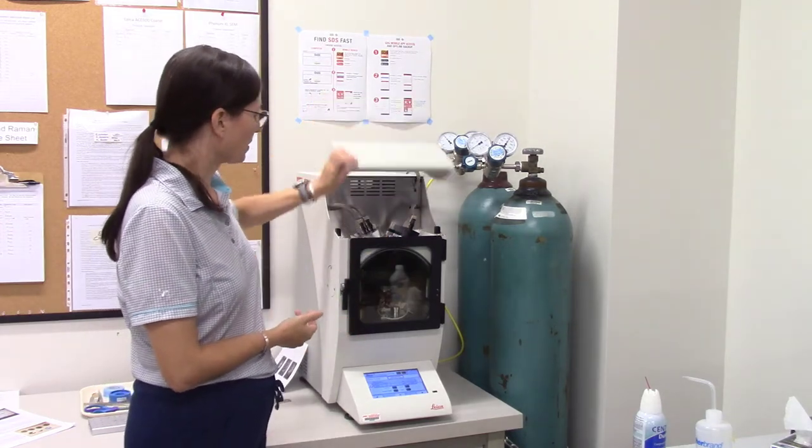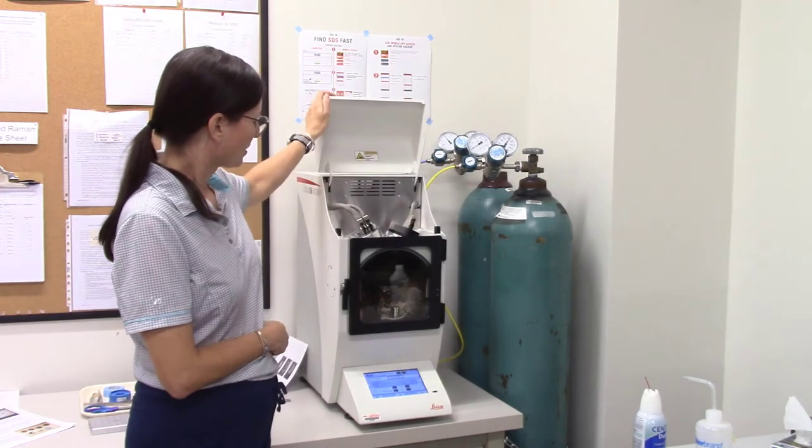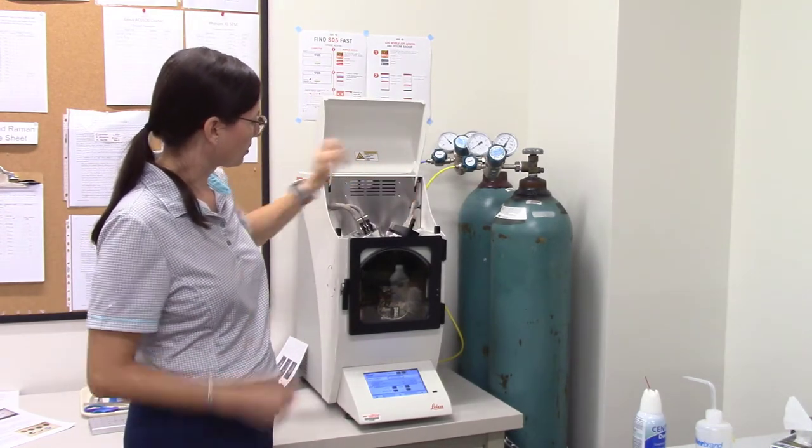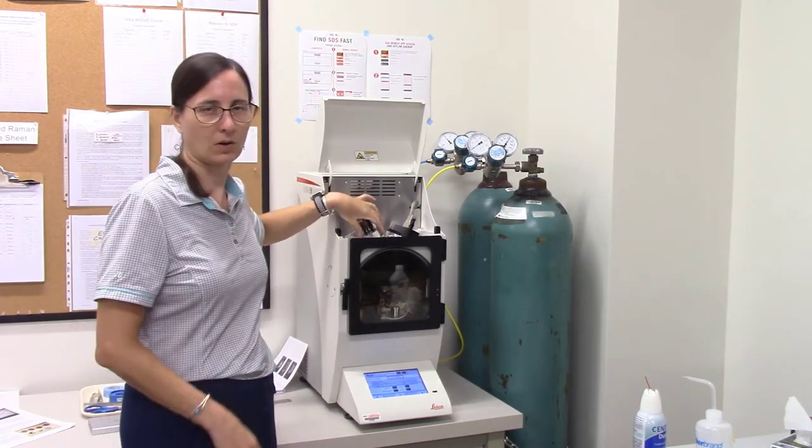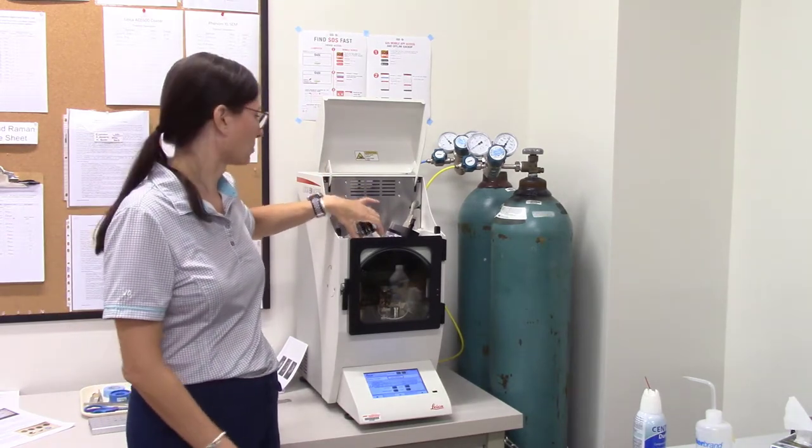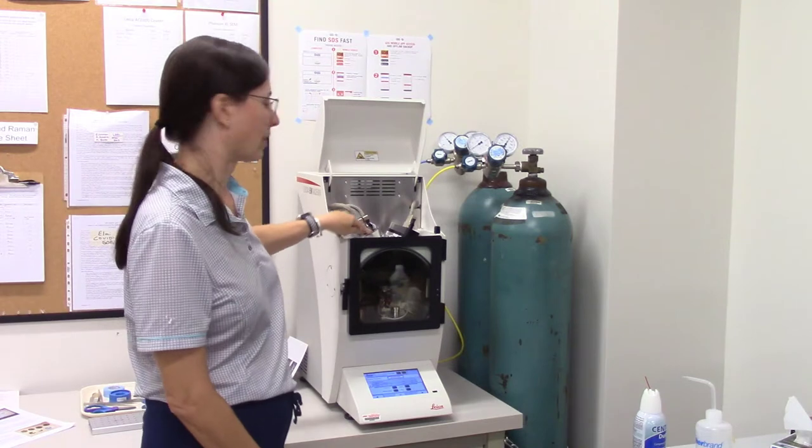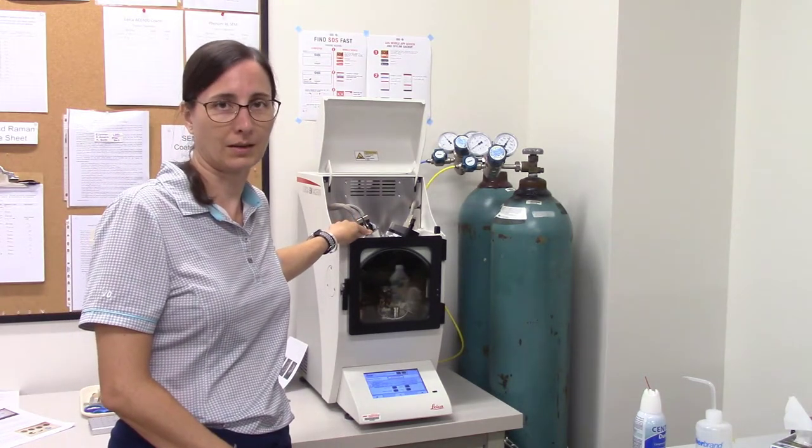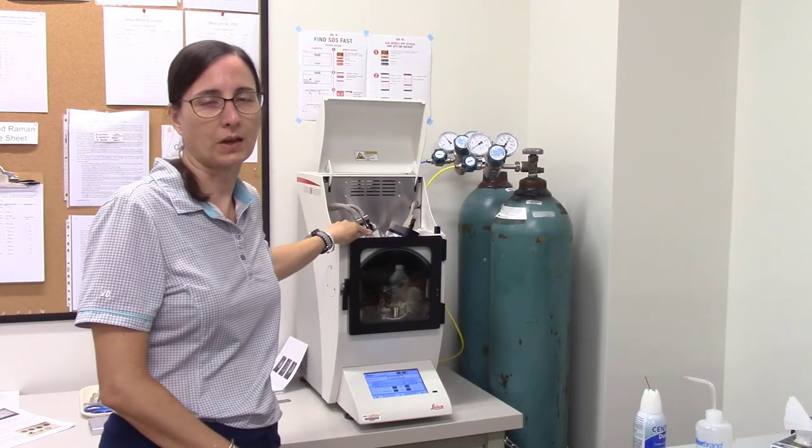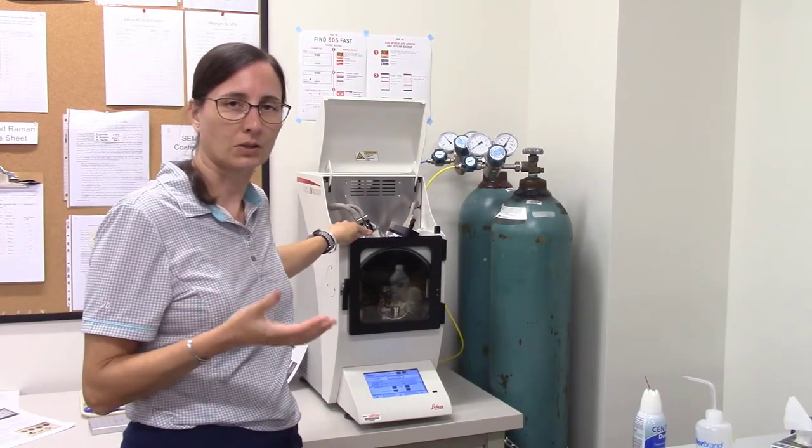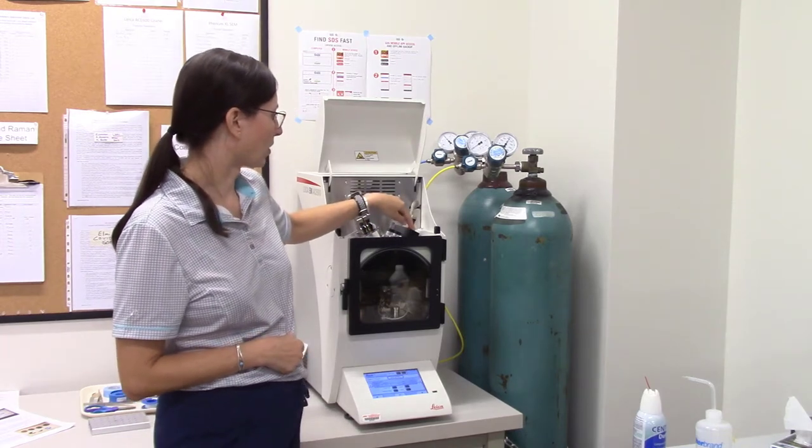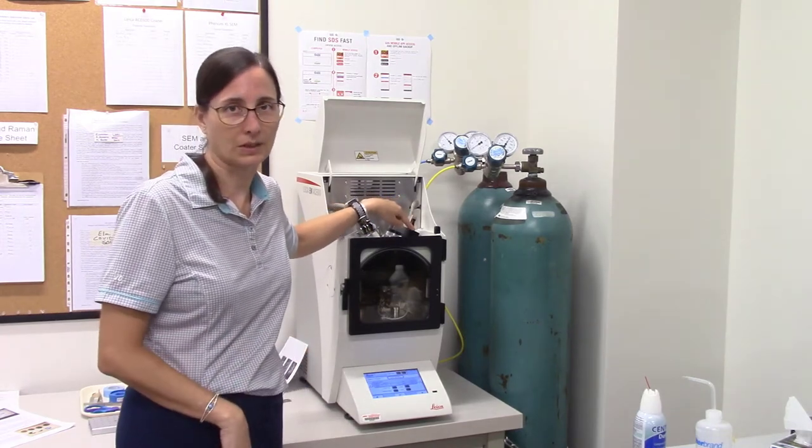So I have the top open here right now. You can see cables coming in. These are two gaskets or openings that have attachments. So this one here on the left is for carbon coating. It's what's going to hold the carbon thread, which will be vaporized so that we can deposit the carbon onto our sample. This is for gold coating, so we won't use it here.